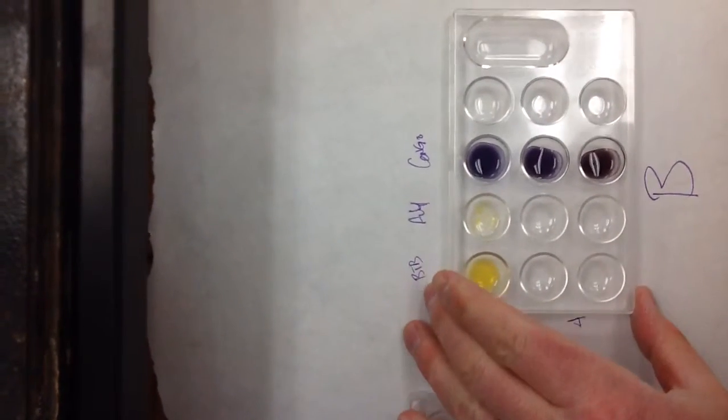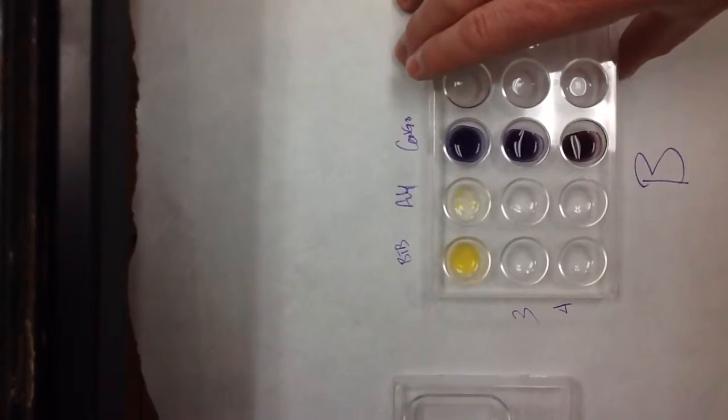Next we have solution B. Okay, move that over, and it's very, very similar. The same process kind of applied because my solution was yellow in bromothymol blue. I went to alizarin yellow, and I went to Congo red. And so the same kind of ideas, and this one too matched pH 3.